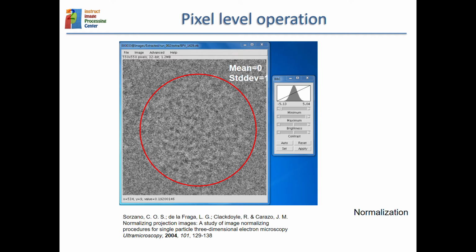We have seen already that you can manipulate the numbers in the matrices in any way that you like, and each manipulation is aimed at highlighting different parts of the signal.